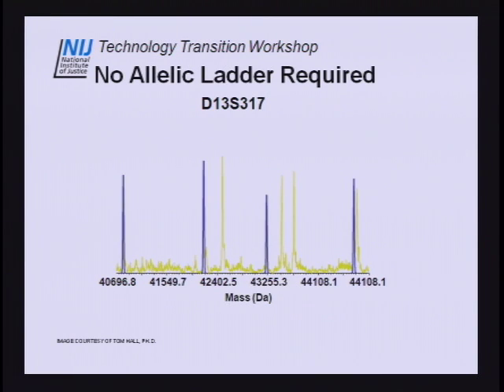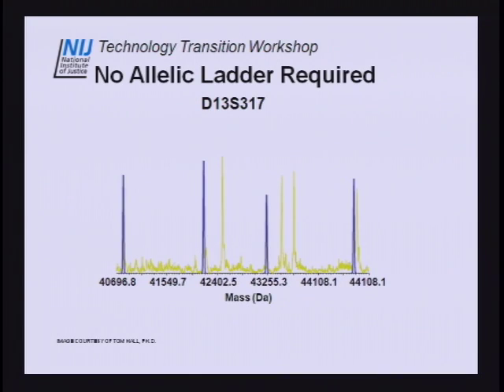This is an example of what some of the data will look like coming out then. Similar to the mitochondrial assay, the only difference is there are 2 chromosomes for each locus now, because mitochondrial is haploid, but this is diploid, so you'll see 2 products per locus, or 1 if it's homozygous. And the difference between this and what you might be used to seeing in a CE is you'll get 2 peaks per product rather than 1, because the strands are separated from each other.